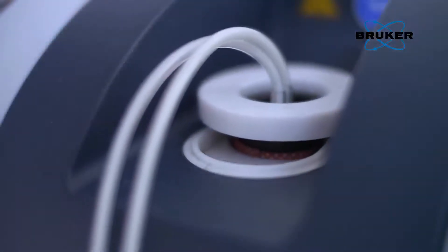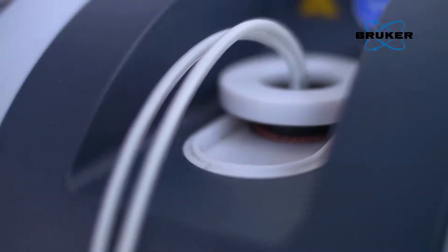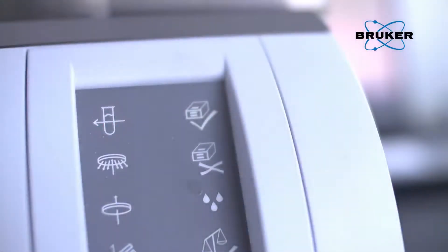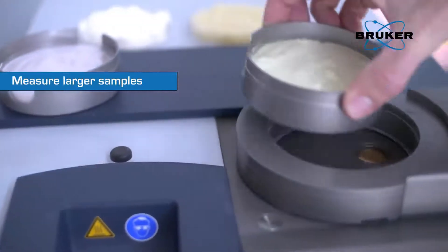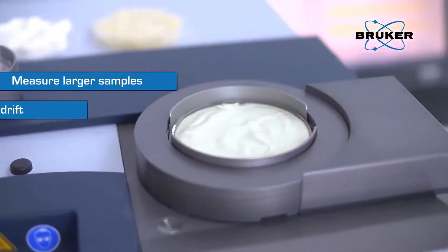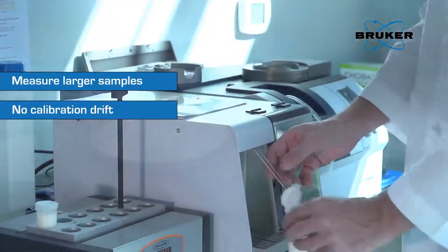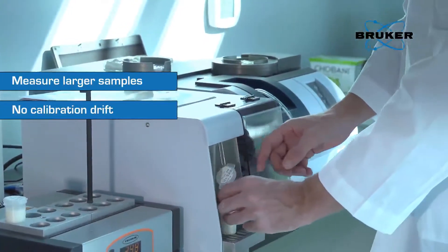Make the switch to FT-NIR. Some benefits of FT-NIR instrumentation, as opposed to FT-IR, include being able to measure larger samples to average out sample inhomogeneity, having no calibration drift or cell replacement required, as the quartz flow cells for liquid measurements are wear-free.